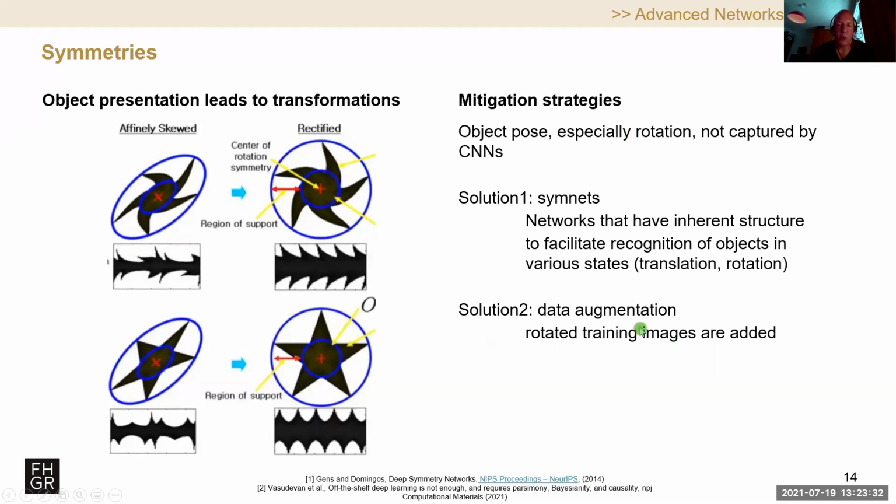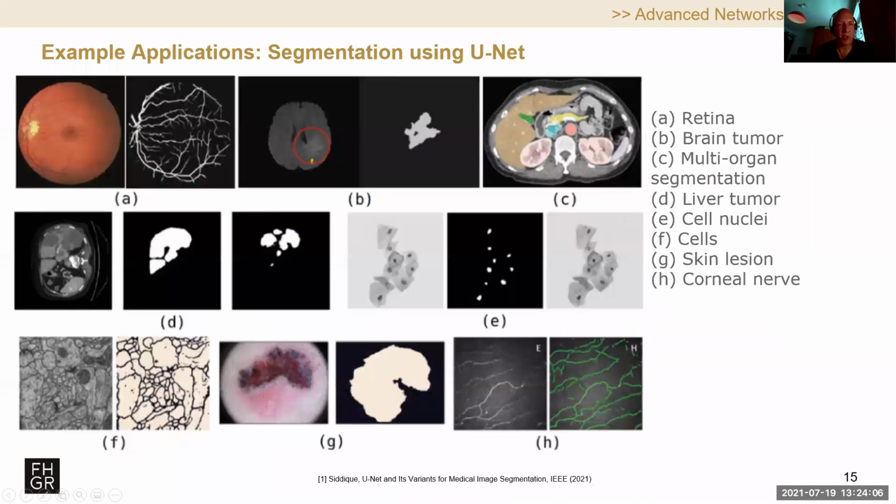Because if your data augmentation is, let's say, too good, you might skip some important results, because during the training you will rotate all your cells and you don't see any gravitational effects after all, which might be there in the original data, but since you have used data augmentation during the training, you don't see it anymore. Or similarly if you use some particular neural networks that have this symmetry involved.